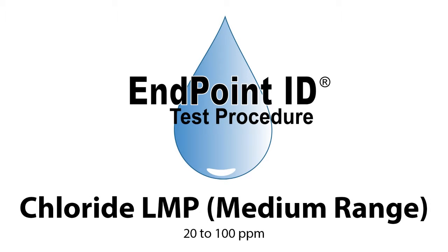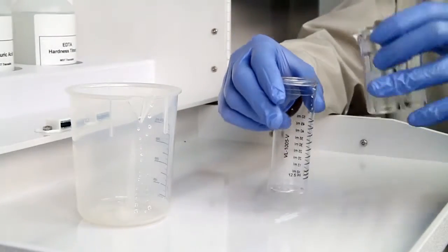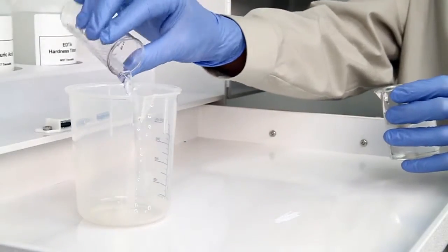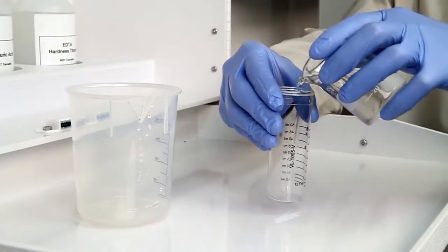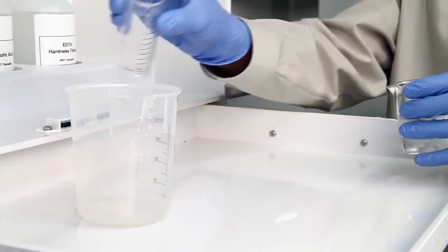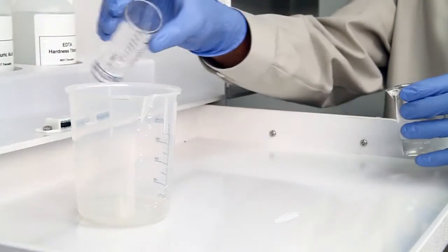This is a demonstration of a medium-range chloride LMP test kit. The first step is to collect an accurate sample. The smallest change in sample size will lead to inaccurate results. Before collecting your sample, it's important to rinse the vial 3 times with the sample to be tested. This minimizes the chance of contamination from a previous titration.